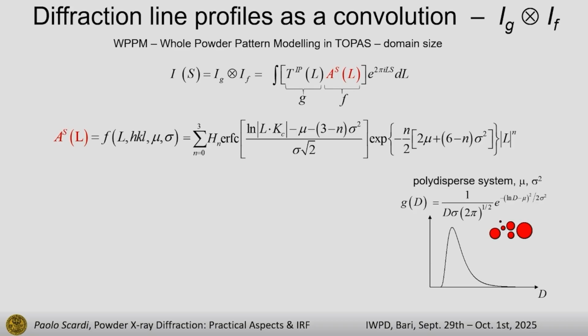Now you say, oh, ugly, terrible, I cannot do that. It looks complex, but it is still a third degree polynomial, because the sum here runs from 0 to 3, and the third power of the distance is here. So in the end, we only changed the coefficients. And it's not so complicated.